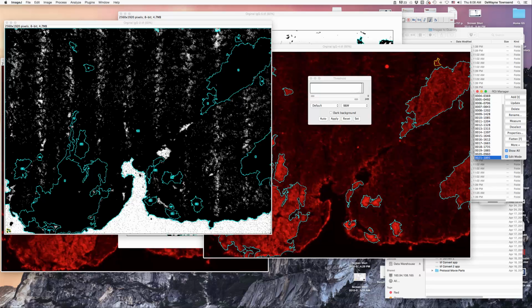21 is just this small little nubbin over here, right? Which isn't really a positive thing, but it's clearly outside the muscle. So what we can do is just delete that in the ROI, so we don't pay attention to it. Let's look at our 21.